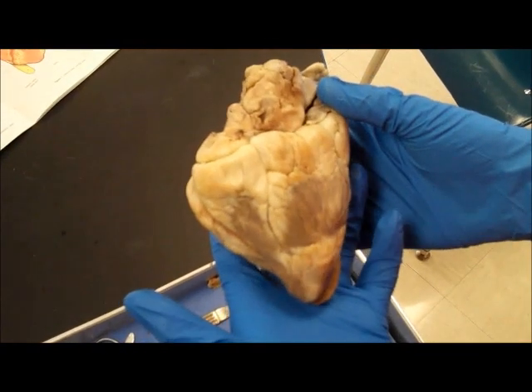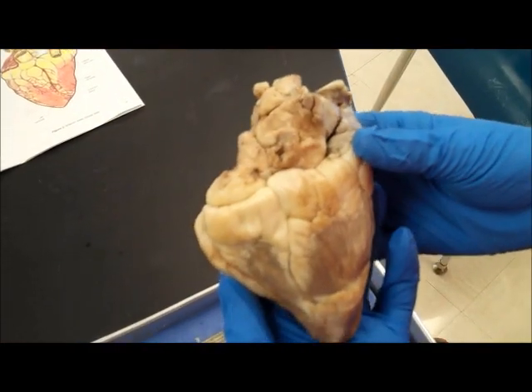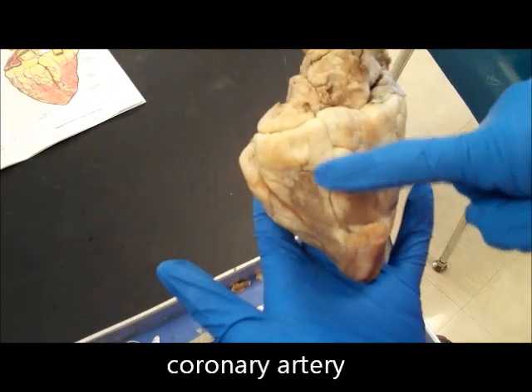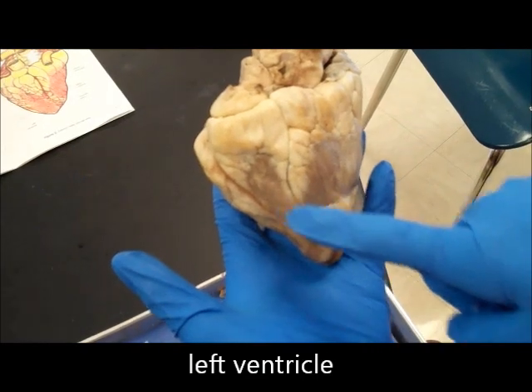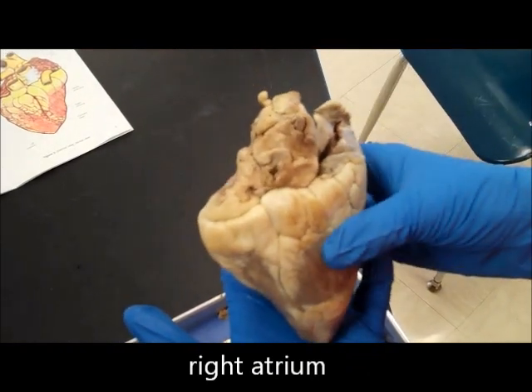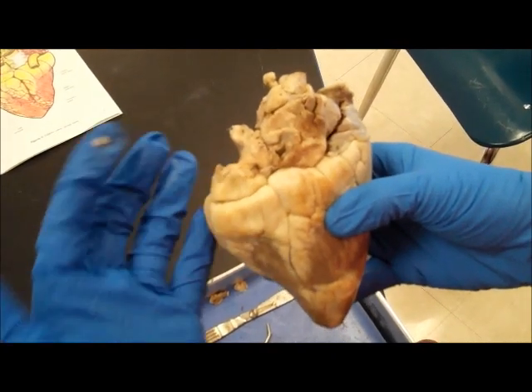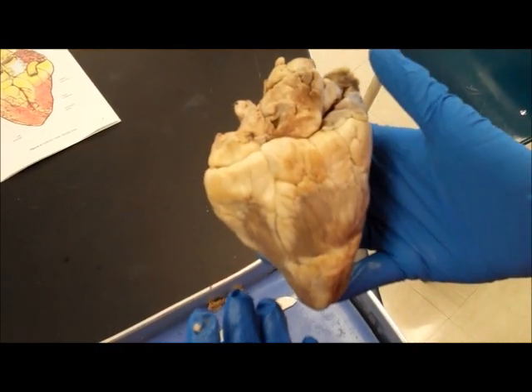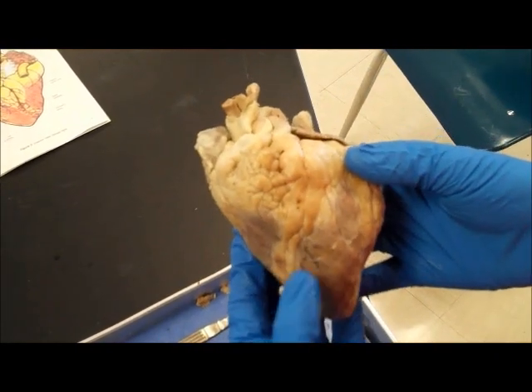We're going to flip our heart over and look at the dorsal side. On our dorsal view, again, we can see the coronary artery coming down the heart, bisecting the heart into two sides. We have the left ventricle, the right ventricle, and the right atrium up here at the top. I've cut through that for later view. And then the left atrium up here on the top. So now we're going to follow the blood flow through the heart, and we'll flip back to the ventral side to go through that.